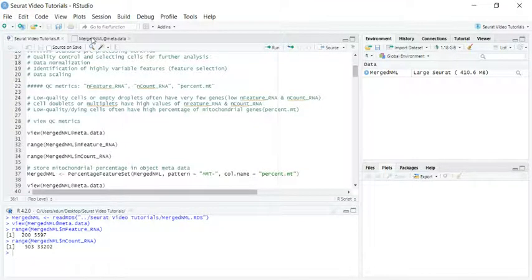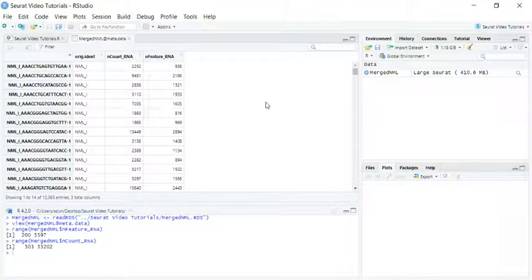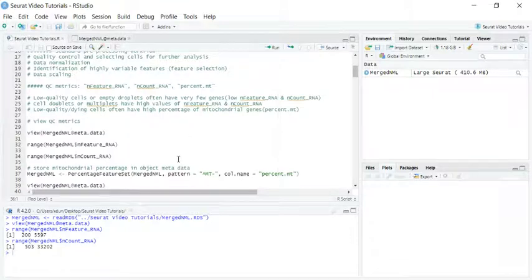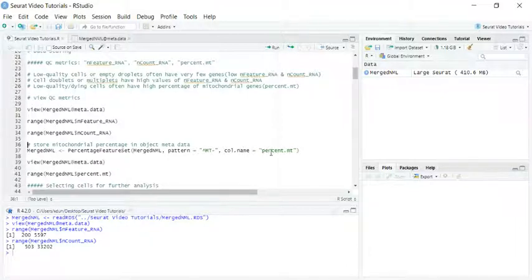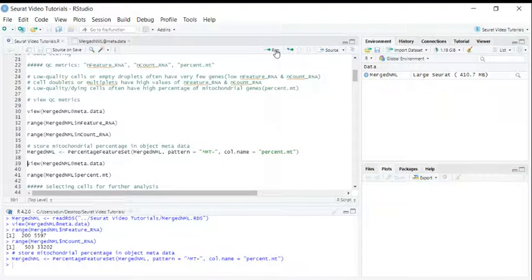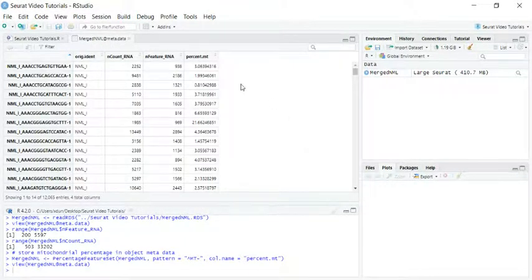We don't have the information for the percentage of mitochondria genes in the metadata at the moment, but we can use the PercentageFeatureSet function to obtain the percentage of mitochondria genes in our object. We can store this information in the column named as %mt. Let's run this function to obtain the information and then view the metadata again.